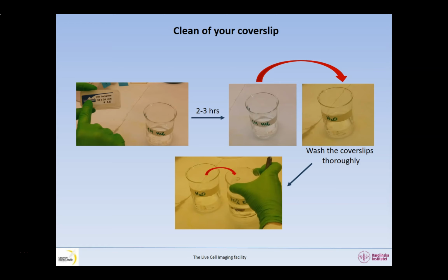After that, I store the cover slips in a beaker containing 70% ethanol. Before using the cover slips, I dry them under the laminar flow hood. You can clean many cover slips at the same time, so it's not a lot of effort to put in.